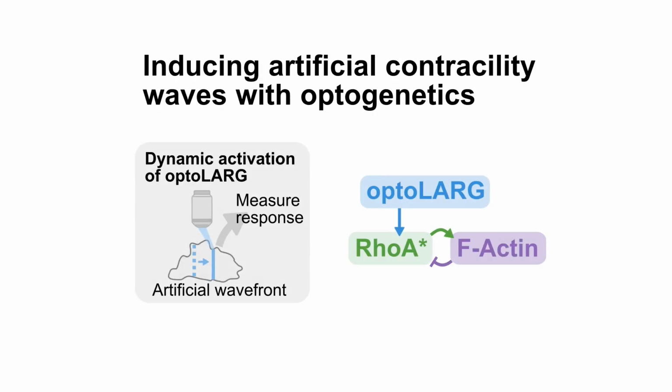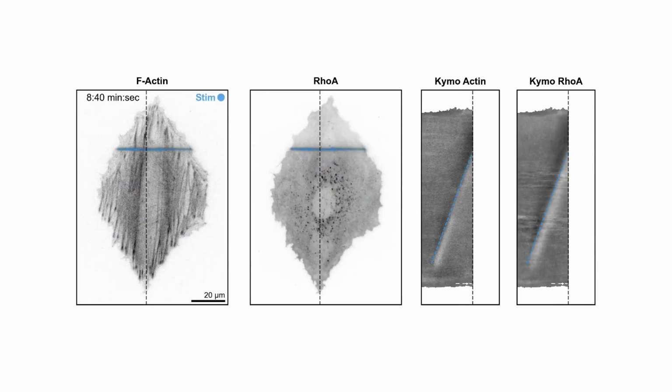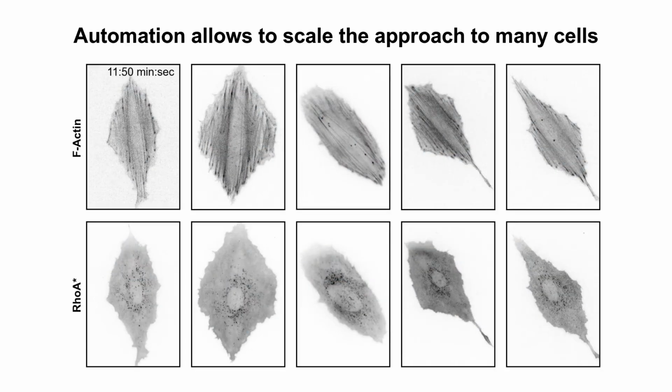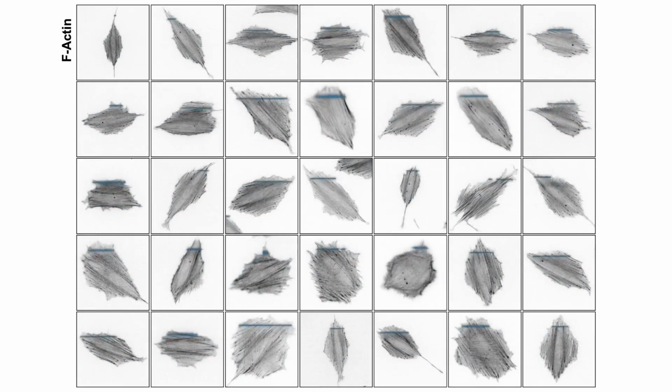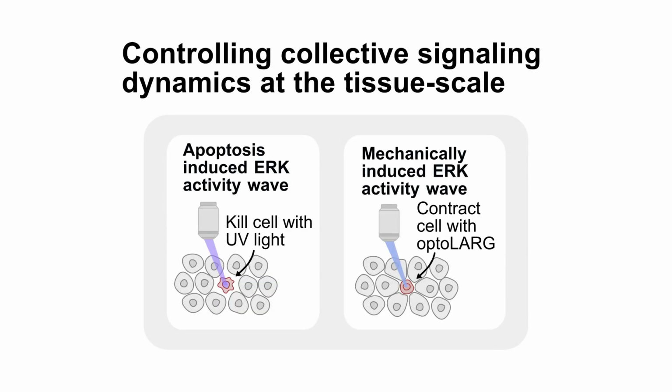Using the same RhoA actuator, we could also create artificial signaling waves, as has been observed naturally in cells. Using FARO, we can now recreate them on demand. This gives us a controllable ground truth to, for example, parameterize reaction diffusion systems that govern these dynamics at the cell cortex. Zooming out, let's look at some applications at the tissue scale.